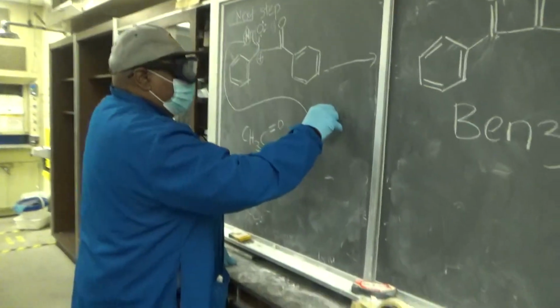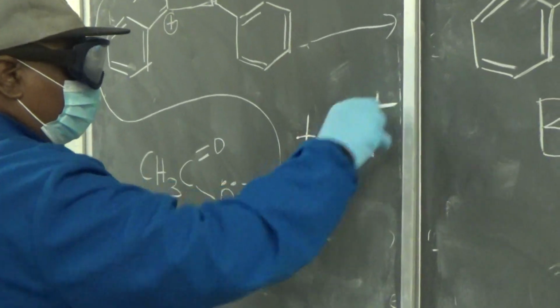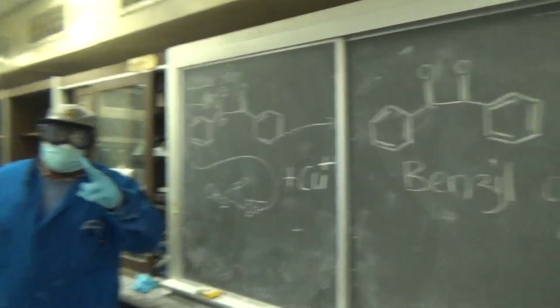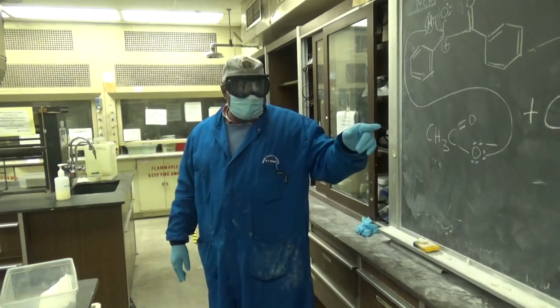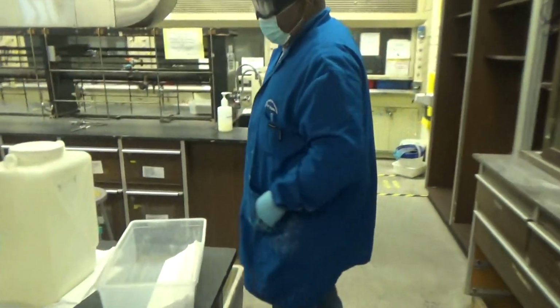Well, I knew the oxidation was happening. Yeah, that's green. Interesting. Oxidation number 2, copper 2 plus, is blue. And copper 1 is green. Do you have the blue stuff again, just to look at it? Blue stuff, yeah, we can show that then.